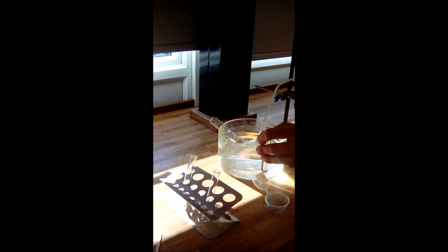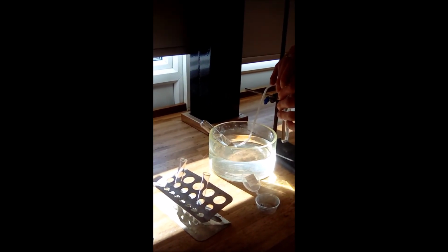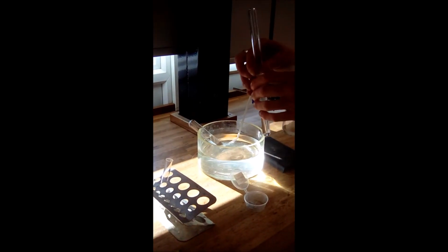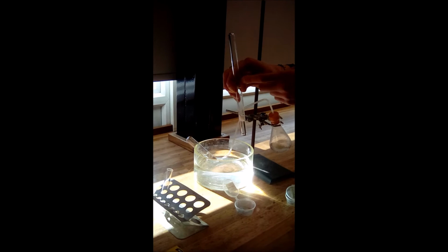So in this test tube here, I've got some hydrochloric acid. I'm going to add some magnesium, and then I'm going to collect the hydrogen gas produced in this test tube up the top here. So what's happening here, hopefully, is we're releasing hydrogen, and then I'm going to collect it in this test tube here.